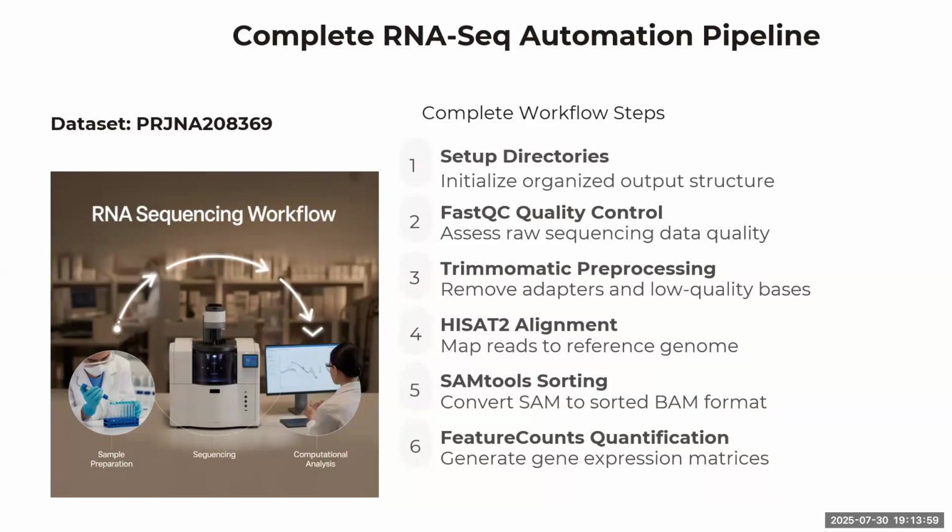We got the trimmed files, and those trimmed files were used for alignment. From the alignment, we got the SAM files. The SAM files were converted to BAM files, sorted, and indexed. And then those files were used for featureCounts quantification. So this is the entire workflow that we use when we are generating the scripts. So this was the introduction to Nextflow.